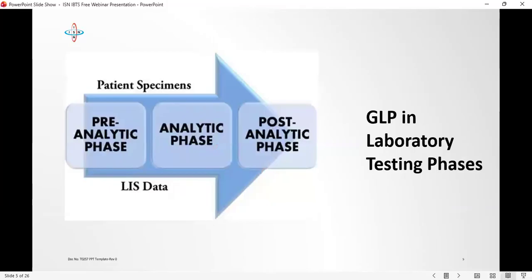So as laboratory personnel, we want to make sure that we are competent. We are also improving. Even as we're working, we're also improving. So when good laboratory practice is put in place, it will ensure competence for your personnel and also their professional growth, okay?